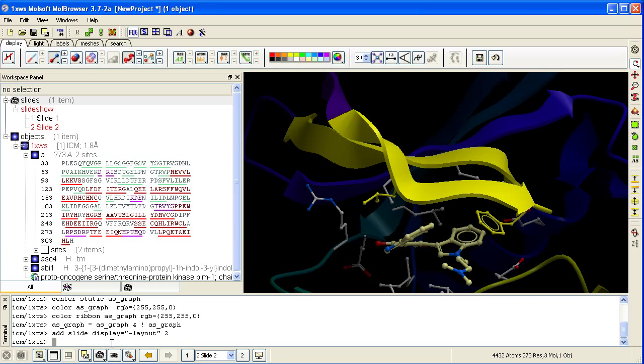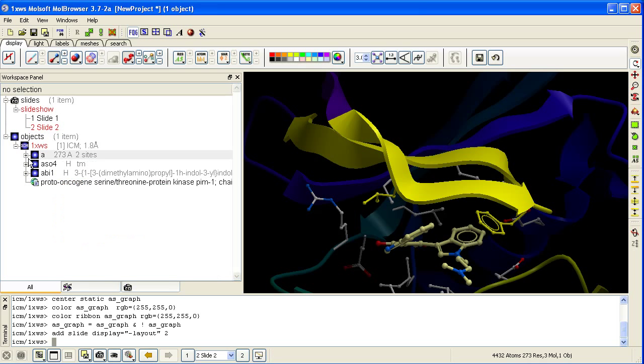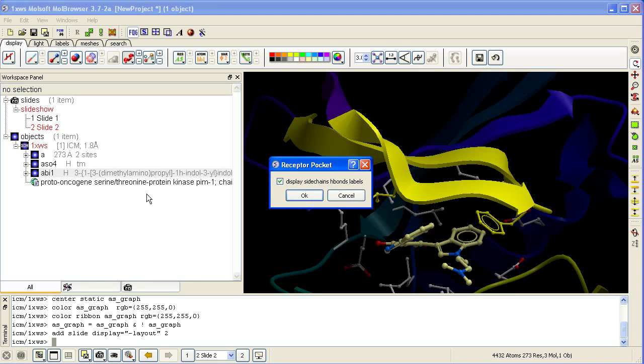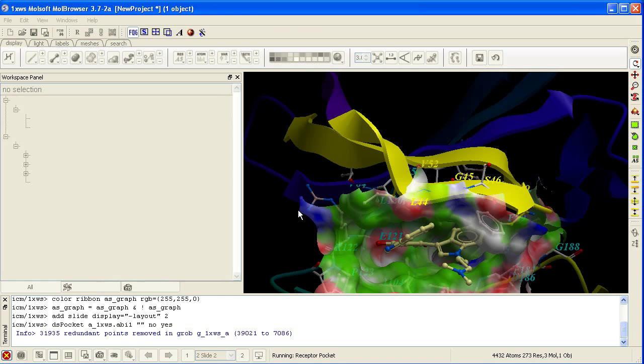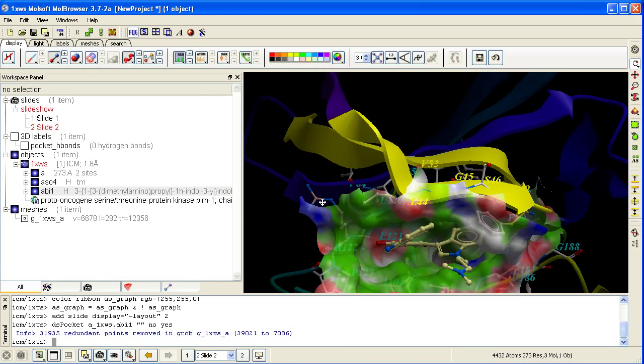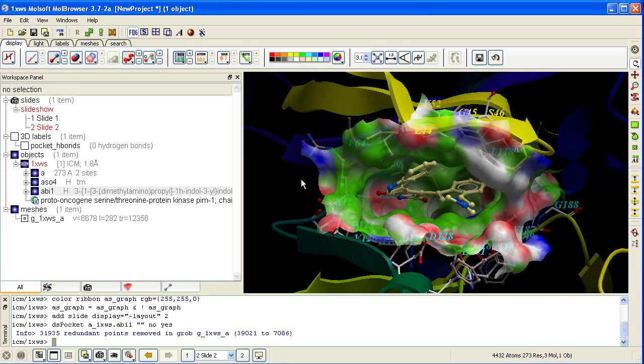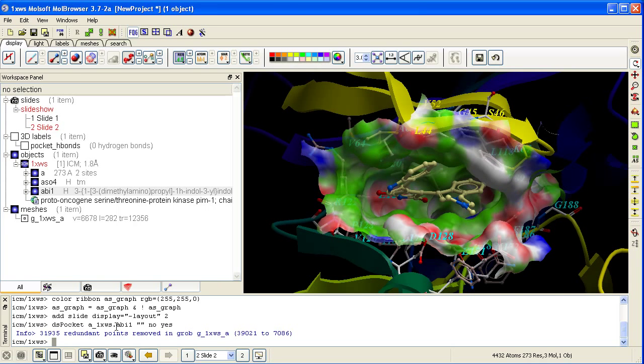The third and final slide is of the ligand binding pocket. Right click on the ligand and select Pocket, Receptor Pocket. Click OK. And this represents our third and final slide. Click here.